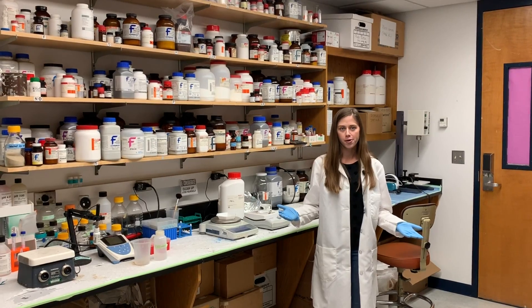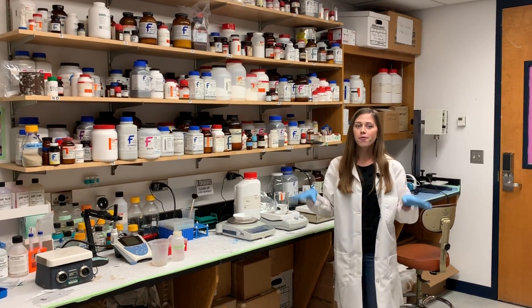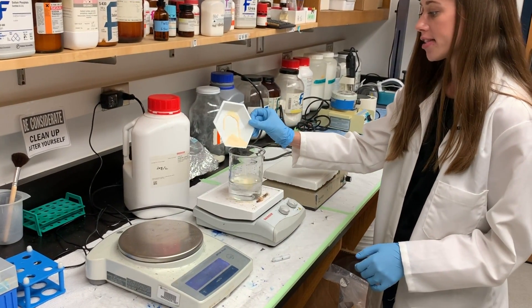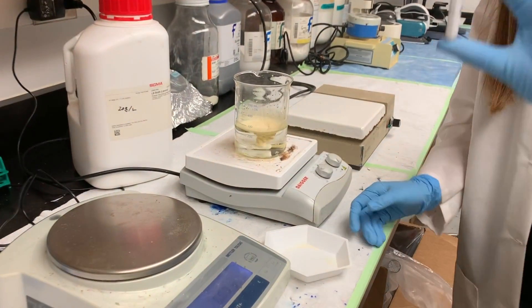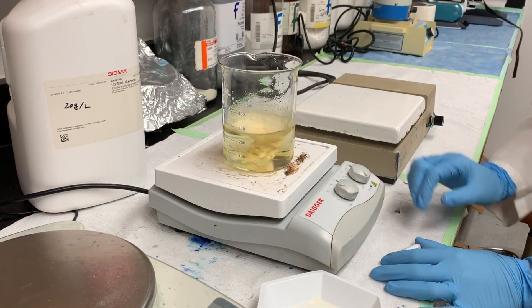Welcome to our chemical room, where we store all of the different chemicals needed for all of our different experiments. This is also where we mix all of our different reagents. We weigh certain things out on a scale and then we use an automated stirring machine to mix our different powders into liquids. It uses a little stir bar like this and a magnetized bottom — we can crank it up and get things stirring.